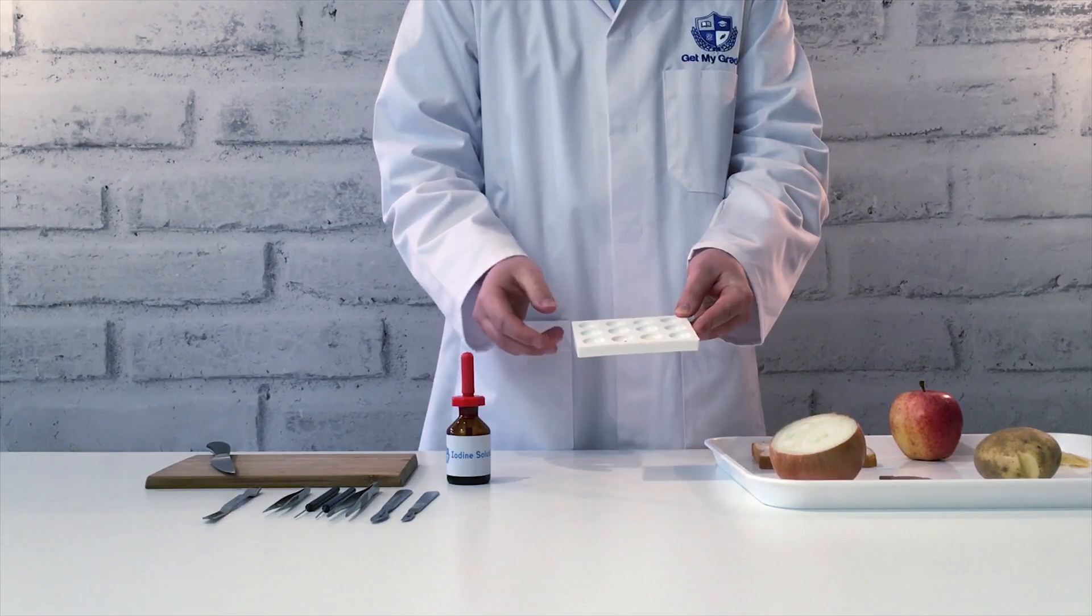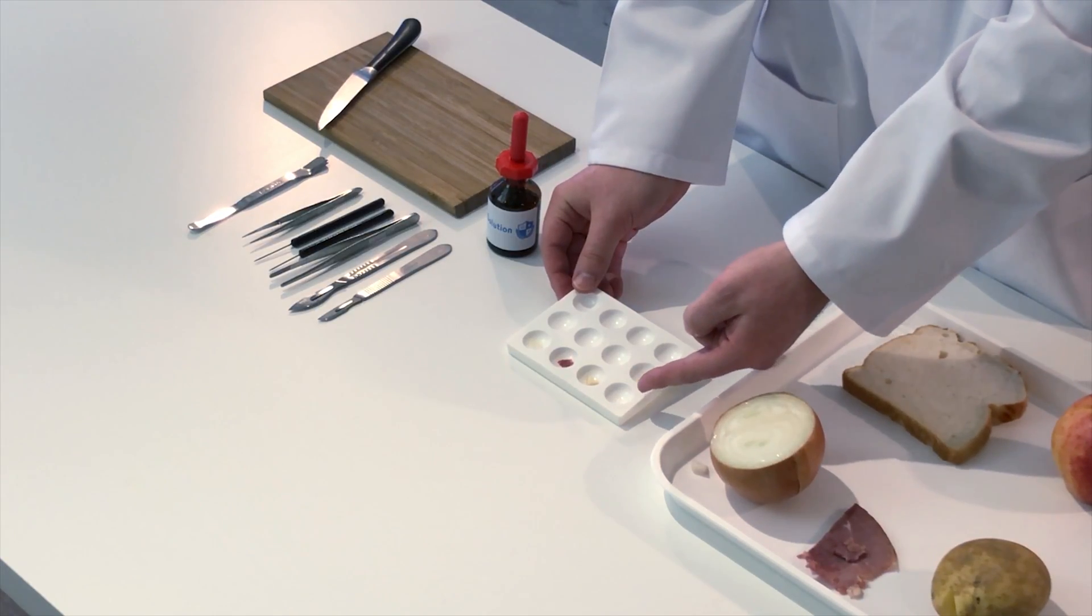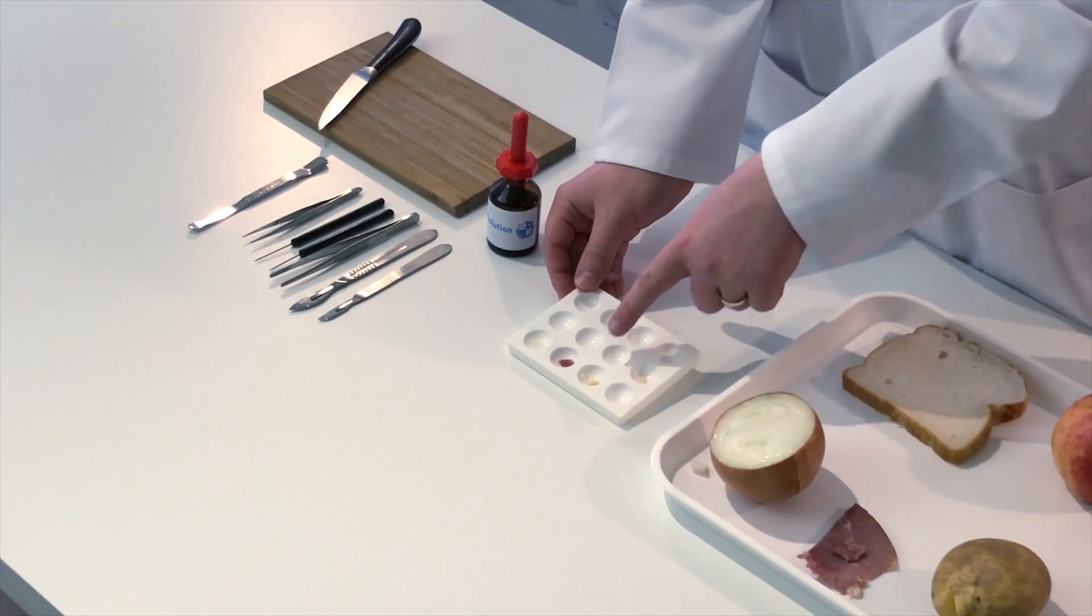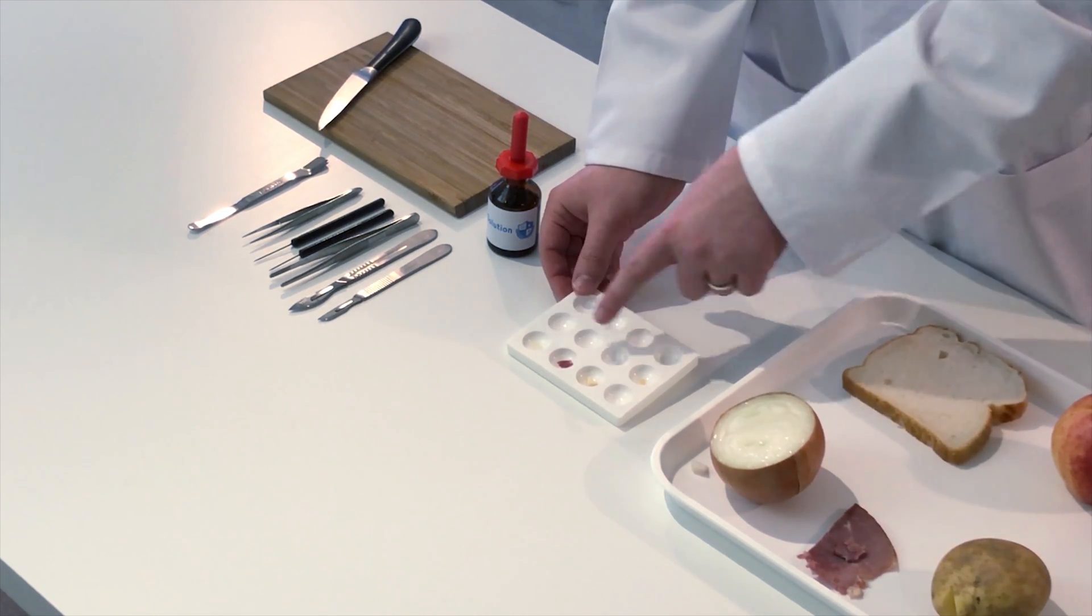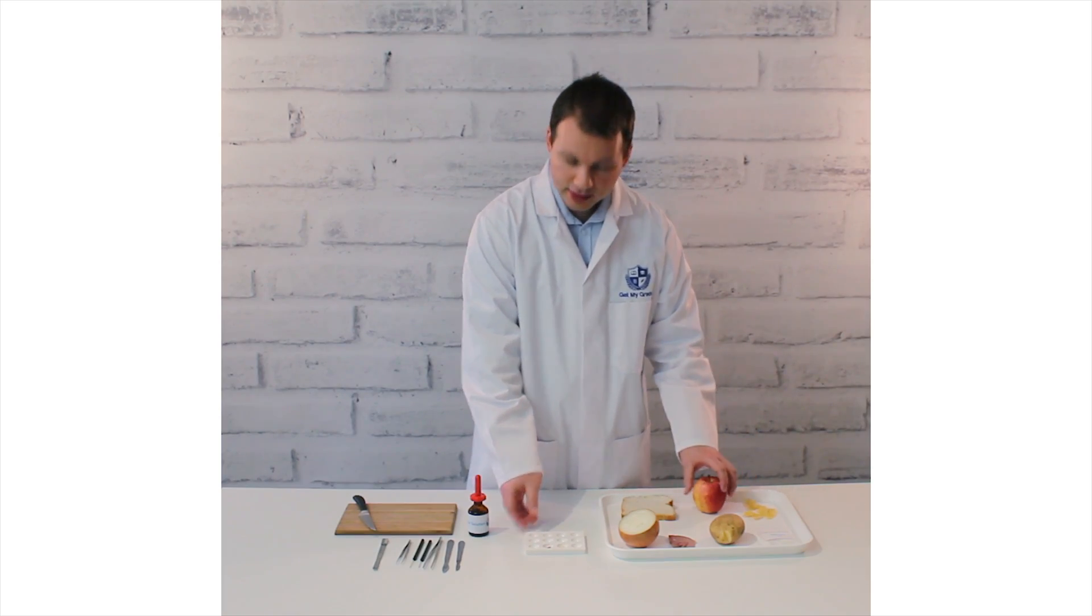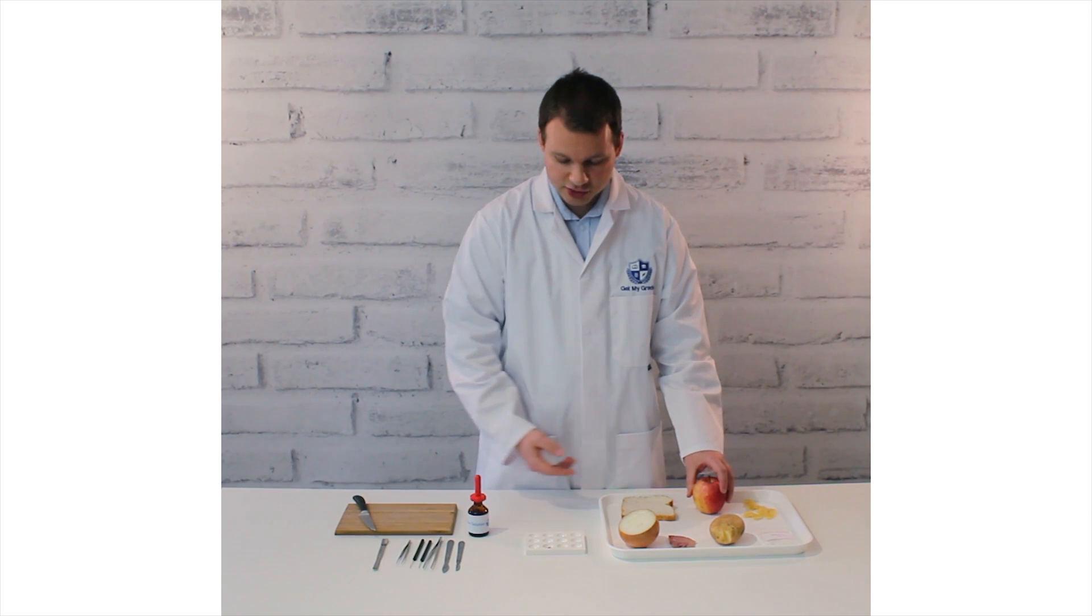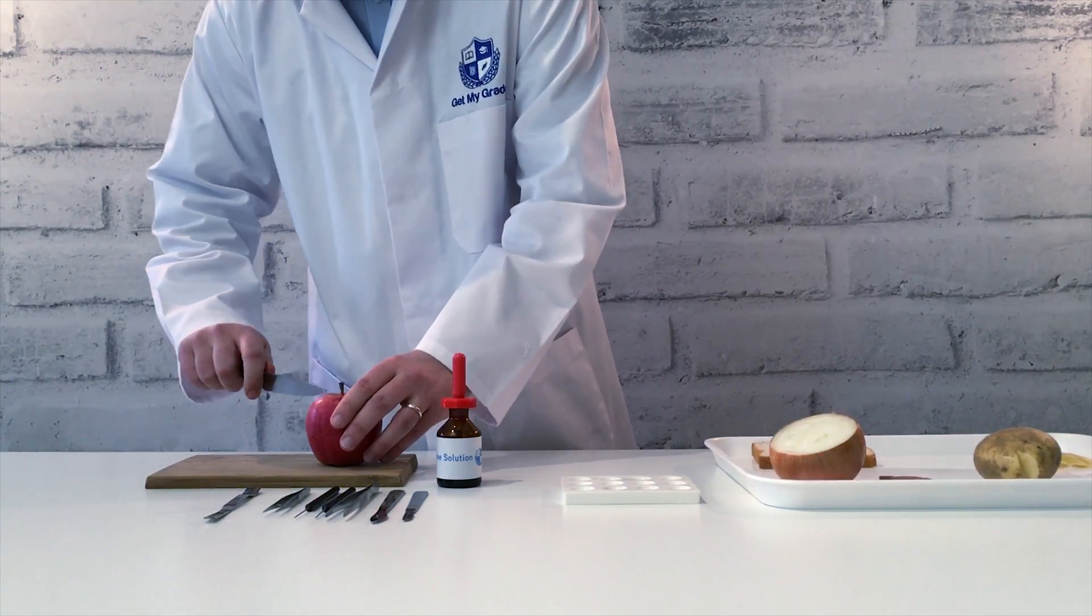I've already put some food samples in the spotting tile already. We've got a small sample of soluble starch, a small sample of potato, a little piece of ham, onion, a bit of pasta. And then I'm going to add some apple and we're going to use some bread as well. I'm going to test all of them for starch. So let's get going.